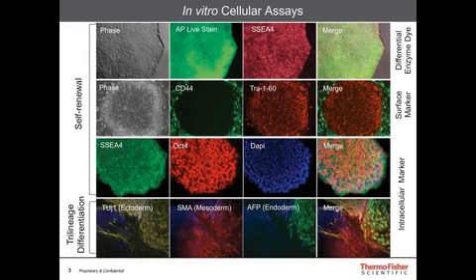On the other end, lineage-specific marker expression in differentiated cells, for example, TUJ1 for ectoderm, smooth muscle actin for mesoderm, and alpha-fetoprotein for endoderm by intracellular staining. Although the antibody-based staining method is easy to use, these are a bit subjective, and one of the major drawbacks is low throughput. They are not scalable. Here come the molecular methods.